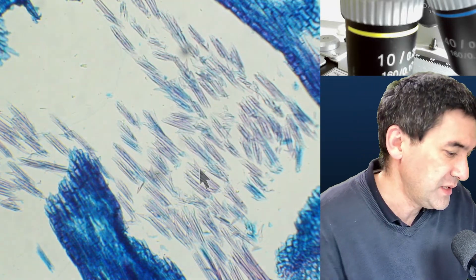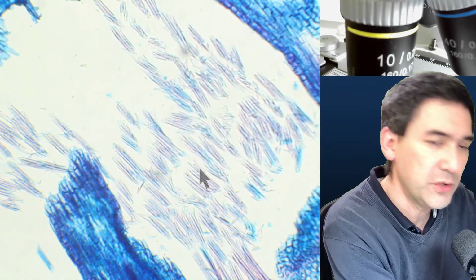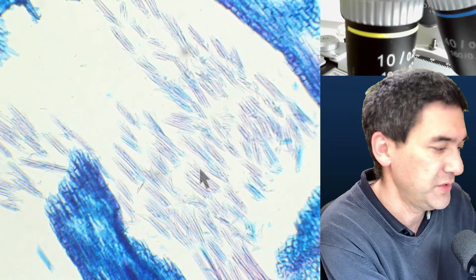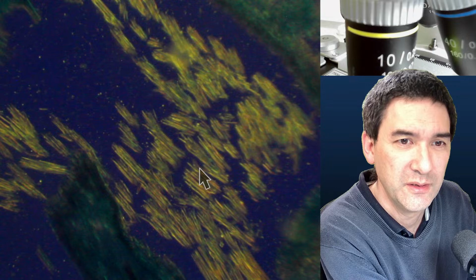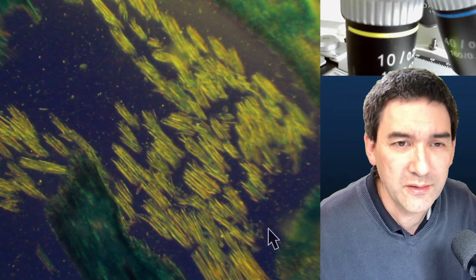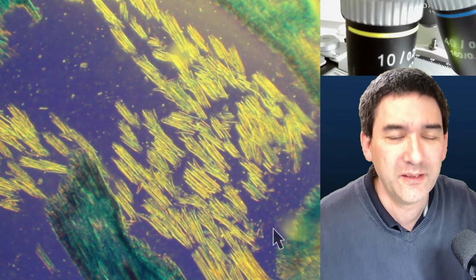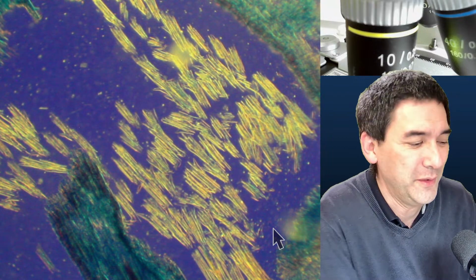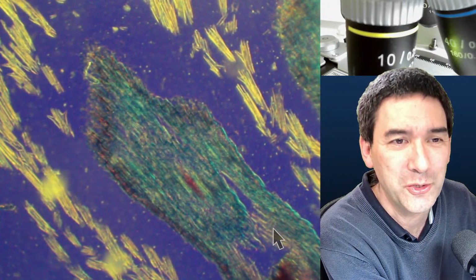And the interesting thing here is that they start to shine up first and better compared to the other parts. Look, it's actually quite nice. You see that those parts pick up the yellow color, while the other parts of the specimen, not so much.